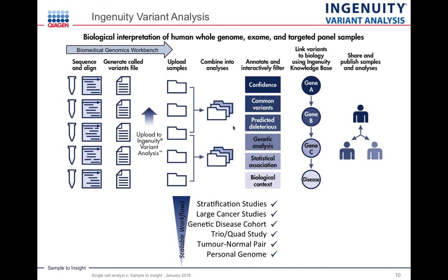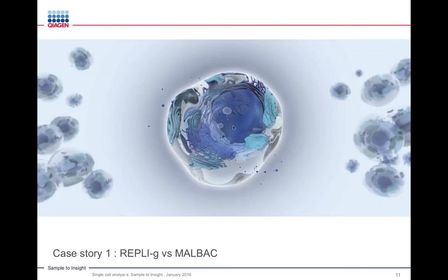And obviously, when we're talking about single-cell analysis, it would be to your definite advantage to use this to analyze common or shared variants amongst cells that are coming from the same biopsy, and those things that are different, to be able to know what's unique and what's shared, what are possible driver mutations, and how the populations may be changing over time. So really powerful tools that you can store and share with other colleagues.